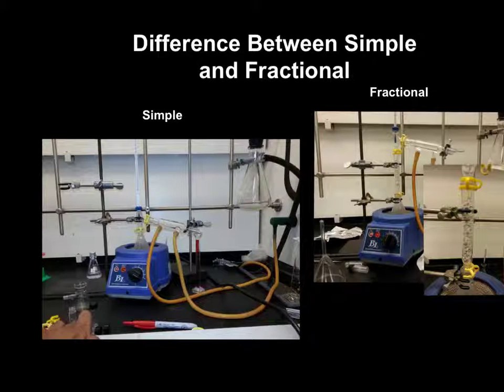The difference between simple and fractional distillation is the fractionating column, which we have here, and it's absent over here. This little addition to the distillation system allows for a more efficient separation of the substances, as I will explain in the next slide.